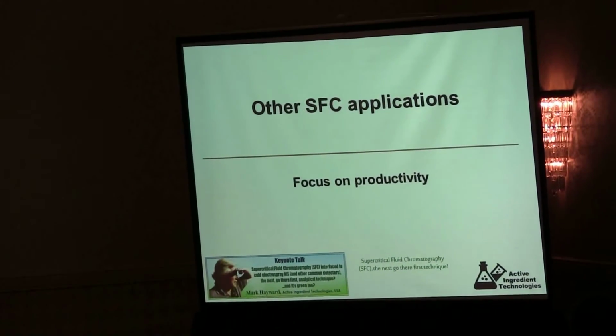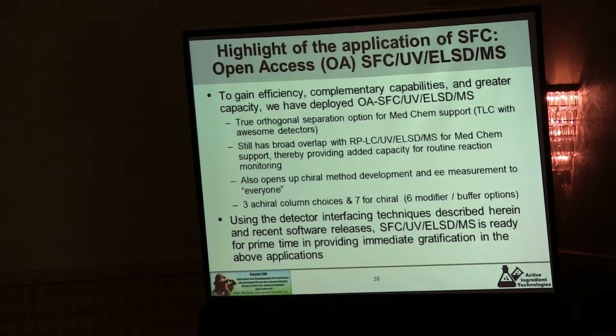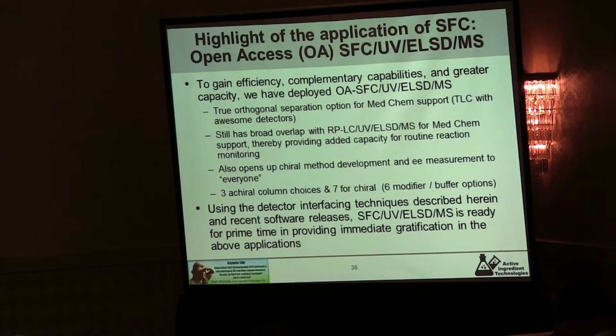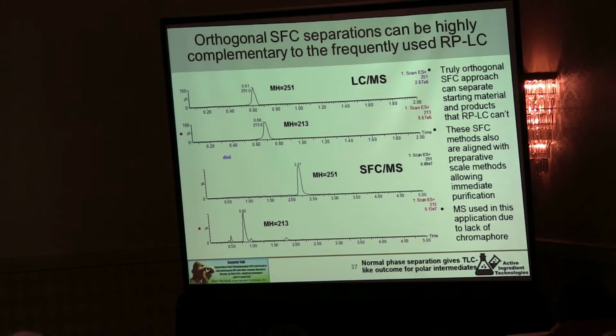So just a little bit about outcomes. This gave us enough comfort that we thought we could deploy this not just in our own lab, but out to other relatively untrained chemists, and that has been very good success. So here's some example data. You can see there's a good reason to want to use SFC, because sometimes reverse phase LC just can't get you the separation you want, whereas you can get a huge one with SFC.